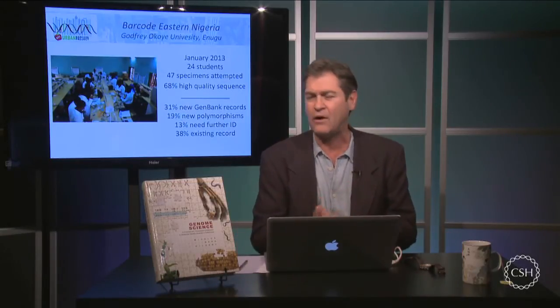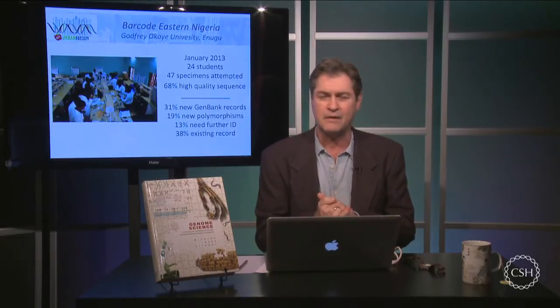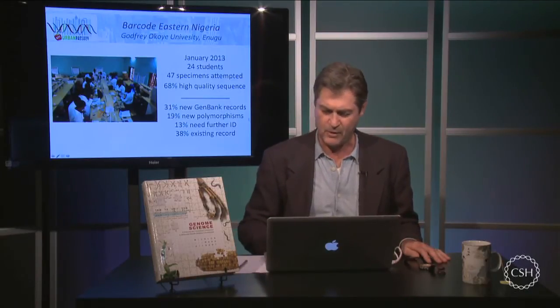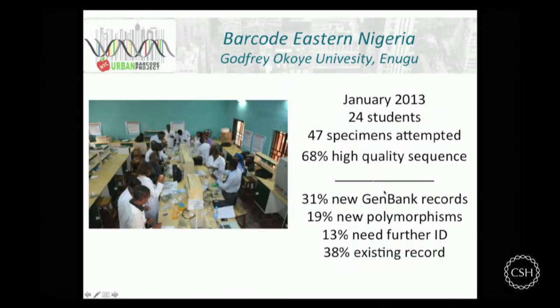And in fact, this is an awful lot of fun for anyone, for me, you, a student, to find a species that's not in the database or new polymorphisms that have not been published. And we're actually in the process of publishing these records right now.